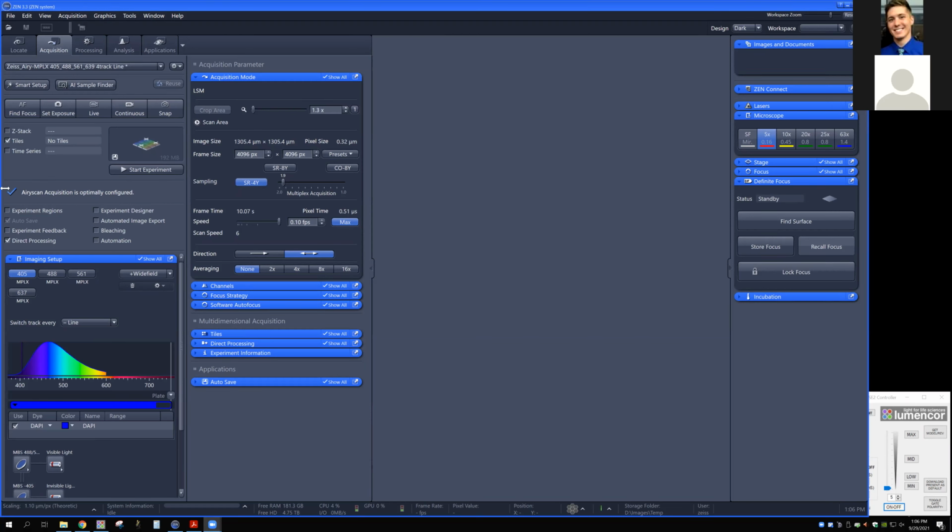I think we're going to do direct processing as a follow-up. I'm still working on getting that connection established.